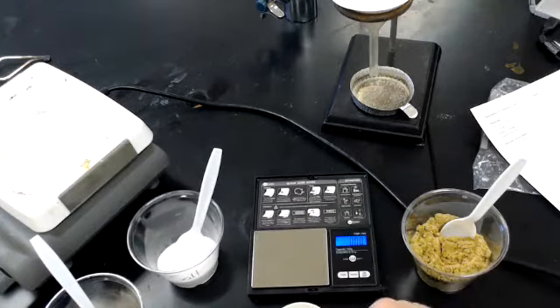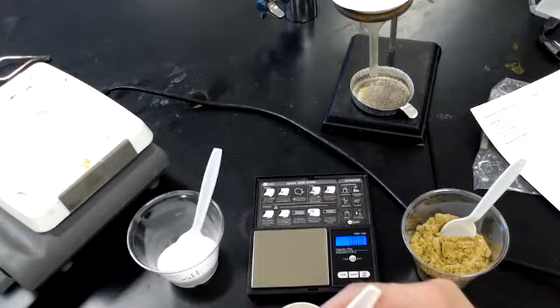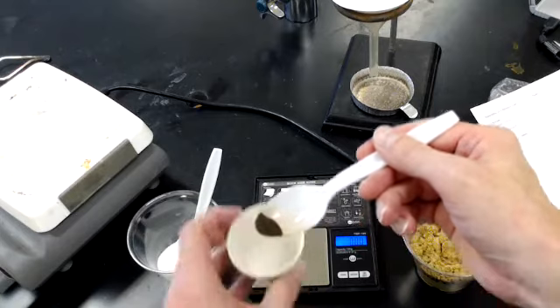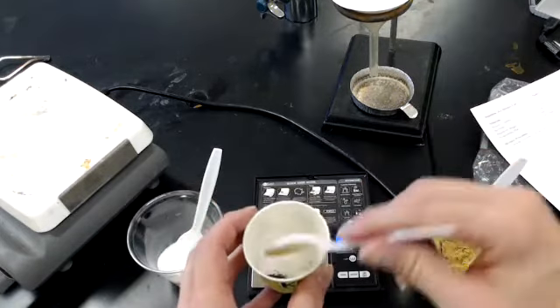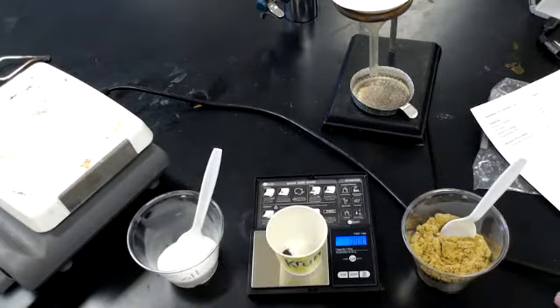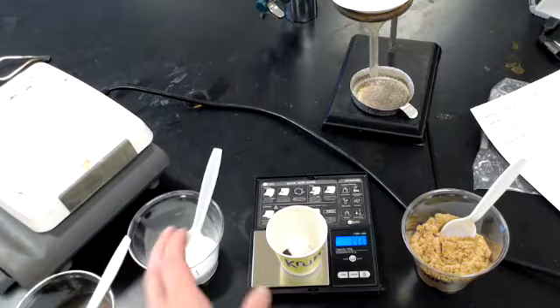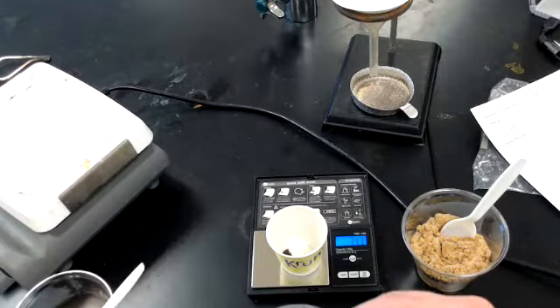Okay, so now I'm going to take this and put a bit of the iron filings in. I have a scoop of the iron filings I'm going to put into my mixture container. There they are. And I'm going to find a new mass, 3.43. Now I'm going to do the same, but add some salt to it.